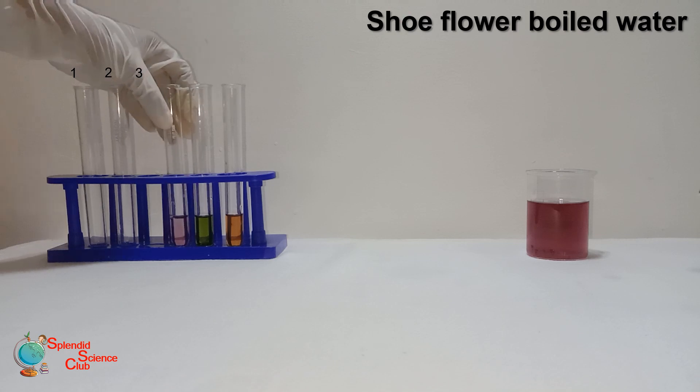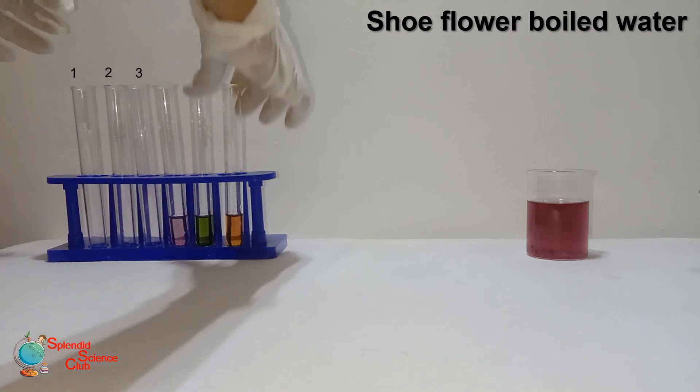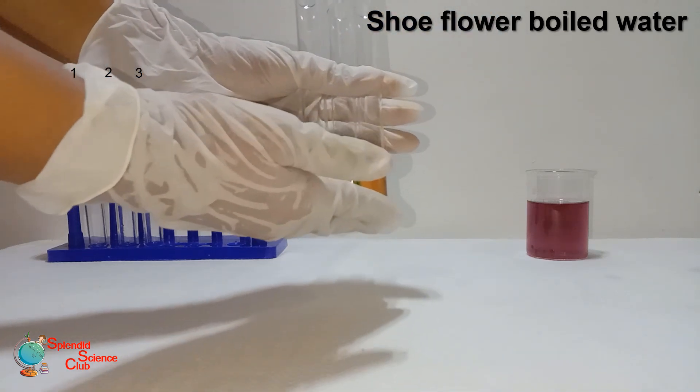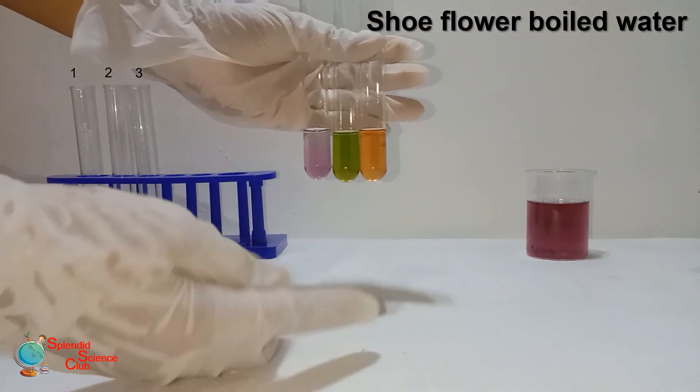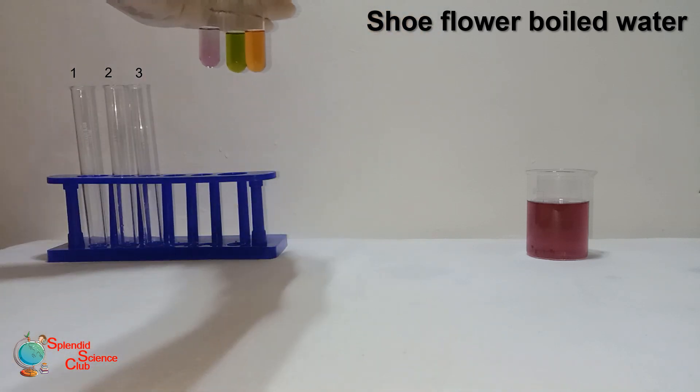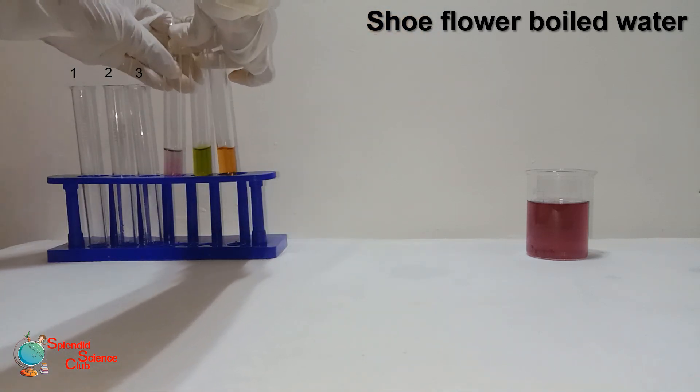You will see they are the same as the previous one. It gives red with acid, green with base, and no color change with neutral substances. We can do this with acids and bases found at home as we stated earlier.